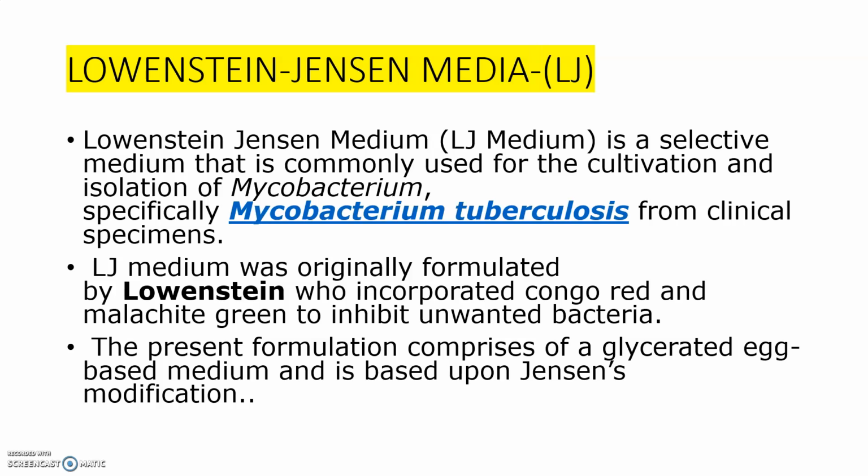LJ medium was originally formulated by Lowenstein, who incorporated Congo red and malachite green to inhibit unwanted bacteria growing in the media. And now the present formulation comprises a glycerated egg-based medium, which is based upon Jensen's modification. So the name Lowenstein-Jensen media.